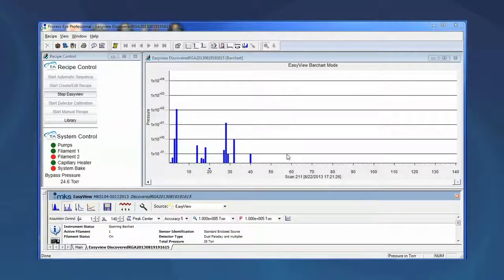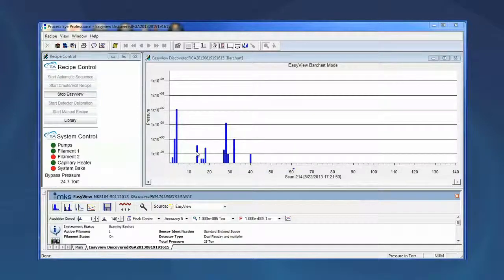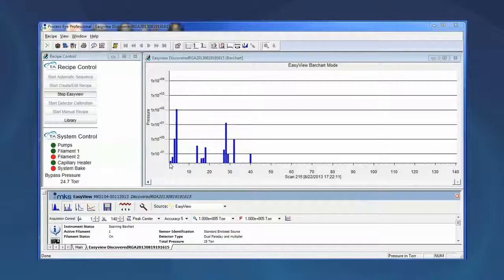Let's quickly go through and identify each of the ions in the background. Mass 40 is argon, mass 32 is oxygen, mass 28 is nitrogen, mass 29 and 27 are isotopes of nitrogen, mass 18 is water, mass 17 is hydroxyl, mass 16 is doubly ionized oxygen, mass 14 is doubly ionized nitrogen. Of course mass 4 is our purge gas helium, mass 3 is likely an isotope of helium, mass 2 is doubly ionized helium, and mass 1 is hydrogen.